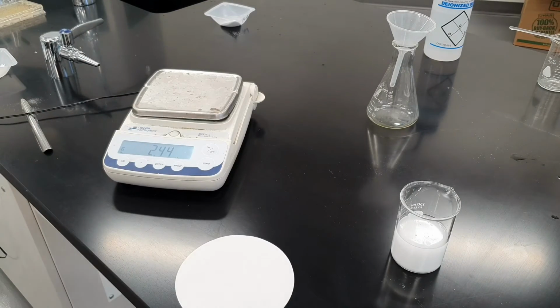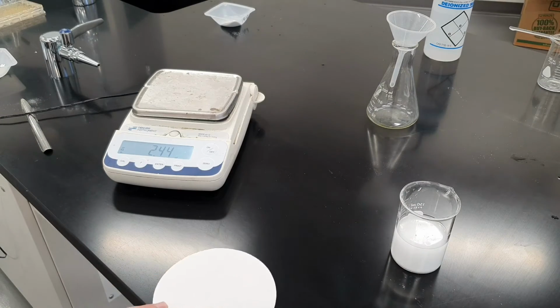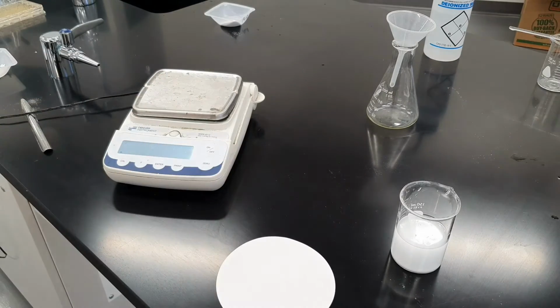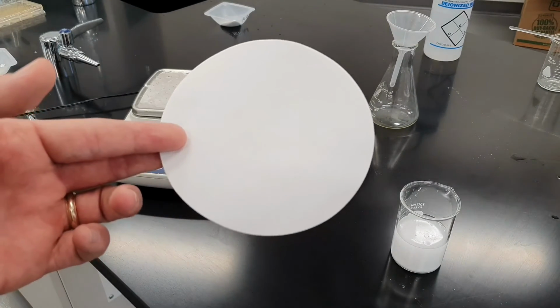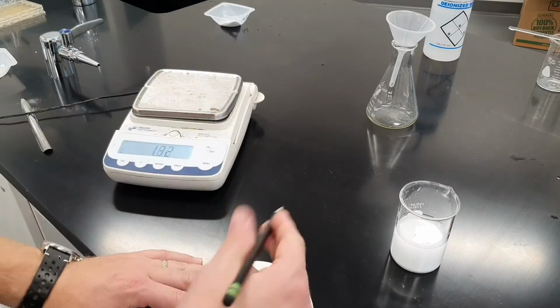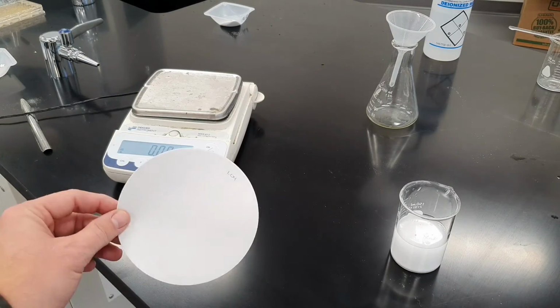Now, the important thing here is that we want that solid, and we want to know how much that made. Okay, that's our product that we're looking for in this lab, is whatever this white solid is. So in order to filter and know how much we have, the first thing we want to do is know how much the filter paper weighs. Because as we filter it, it's going to get stuck on this filter paper, but when we're doing calculations, we don't want to include the mass of the filter paper. So if we measure it here, our filter paper is 1.04 grams. You can just write that on with a pencil, 1.04 grams, so you don't forget.